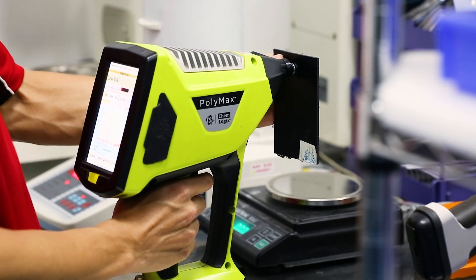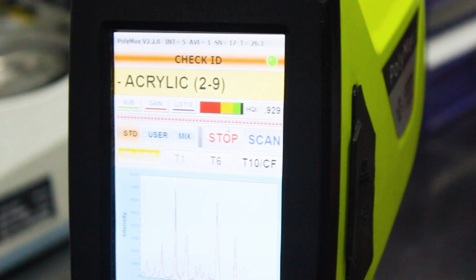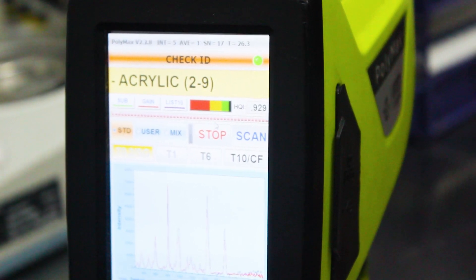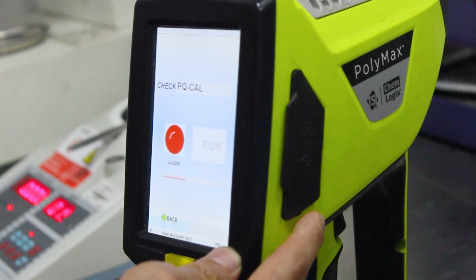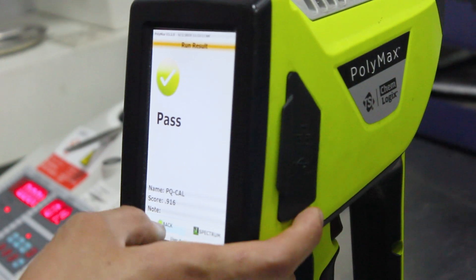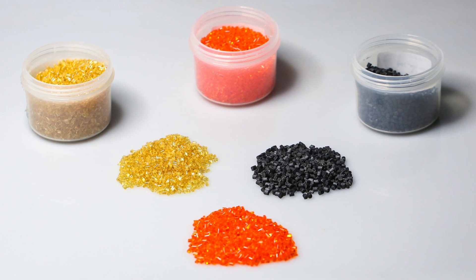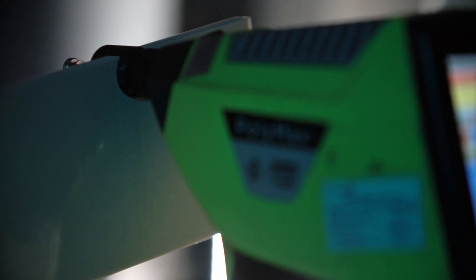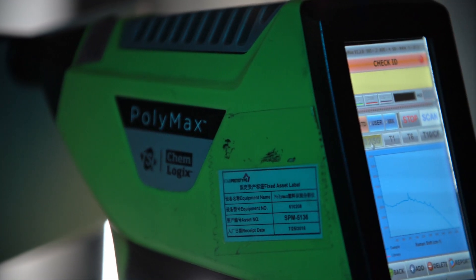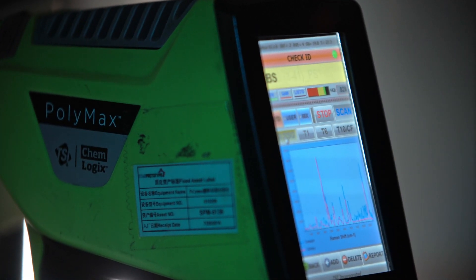This is normally good enough for simple field testing when you don't want to damage the part. The reason we can't guarantee 100% reliability is because the detector can be blocked by dirt on the sample or the lens, or due to incidental light leaking in from the ambient environment. We can also calibrate for a specific resin using one of our 300 or so golden samples. It also helps to do multiple tests in a row to establish both the accuracy of the reading and its precision or repeatability.